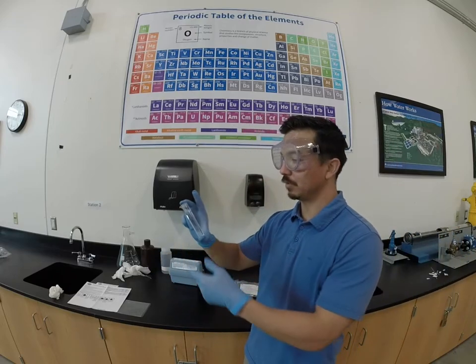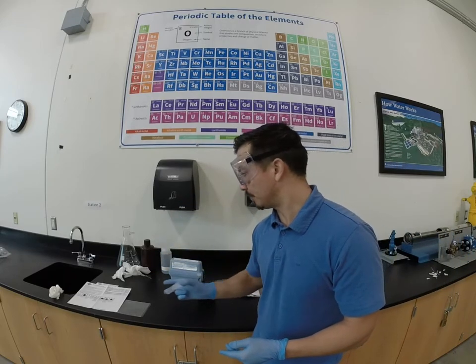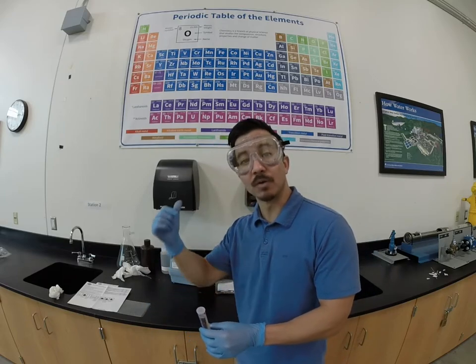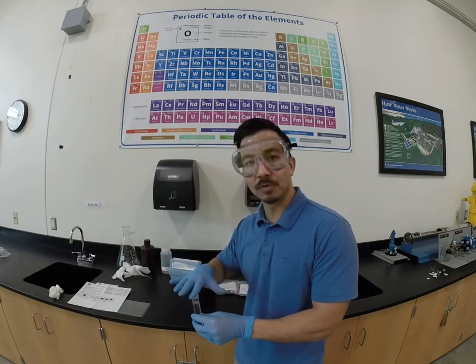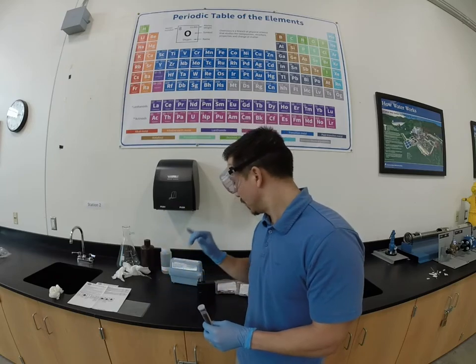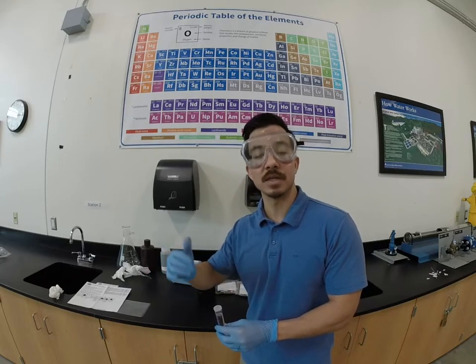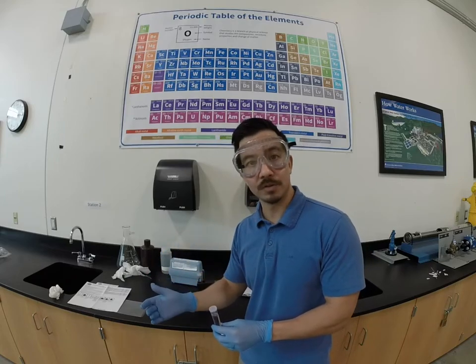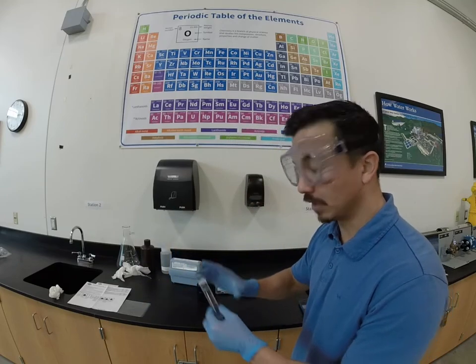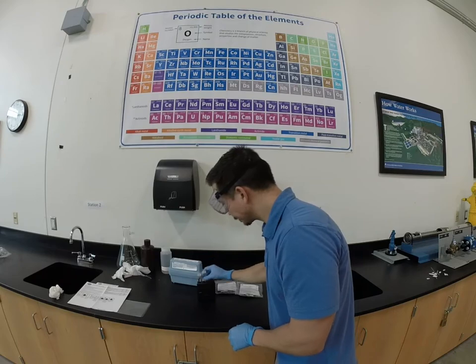We've now added our reagent to our sample. We're going to shake that up really well, then wait one minute and read our sample. It's really important with free chlorine that we read pretty quickly within that one-minute time frame. With total chlorine you would want to wait three minutes and then take your reading, but no more than six minutes — otherwise the sample will change and the color will start to change. So let's start our timer and see where we're at.